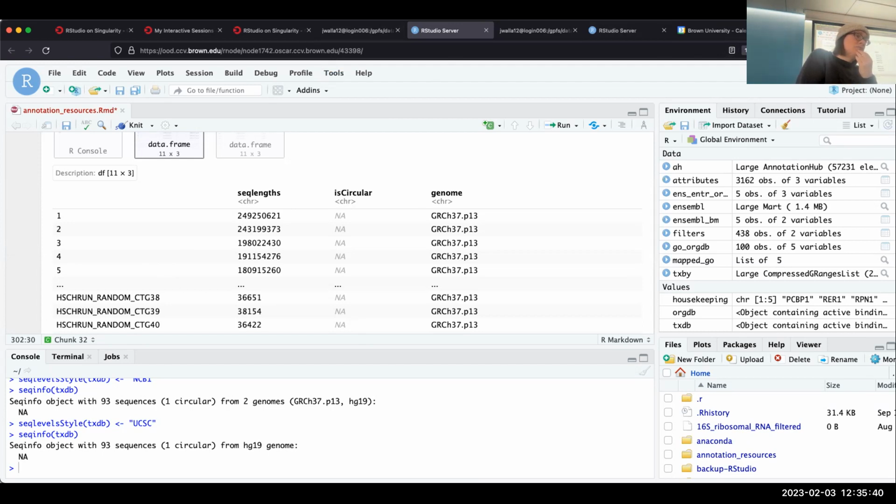If you install it and you're doing an R install on this system, then put it down to the packages, you use the library and it finds it automatically.